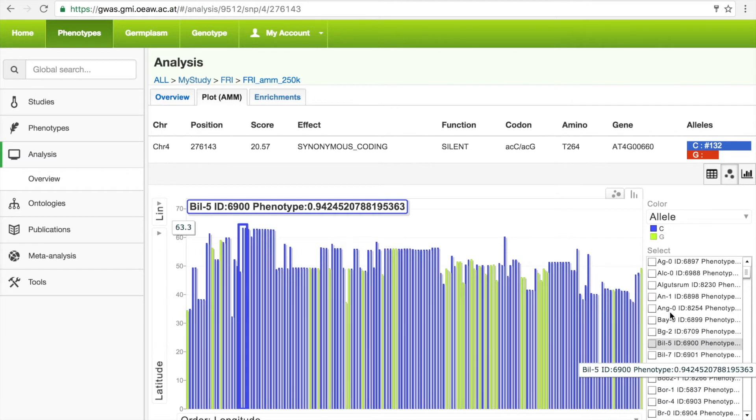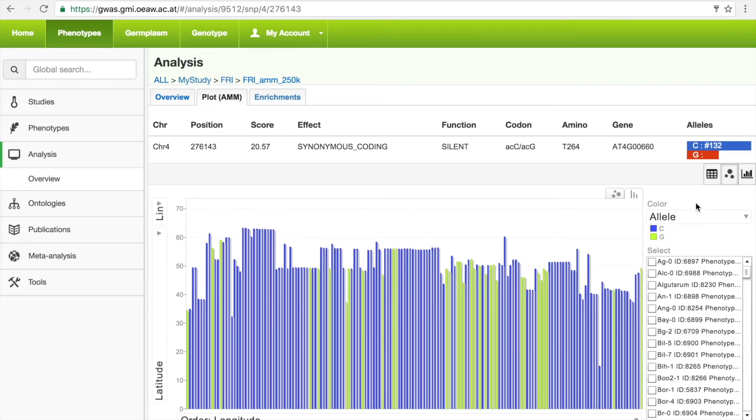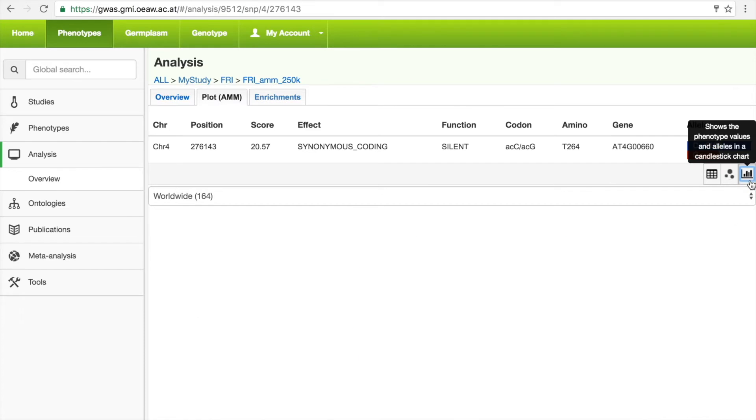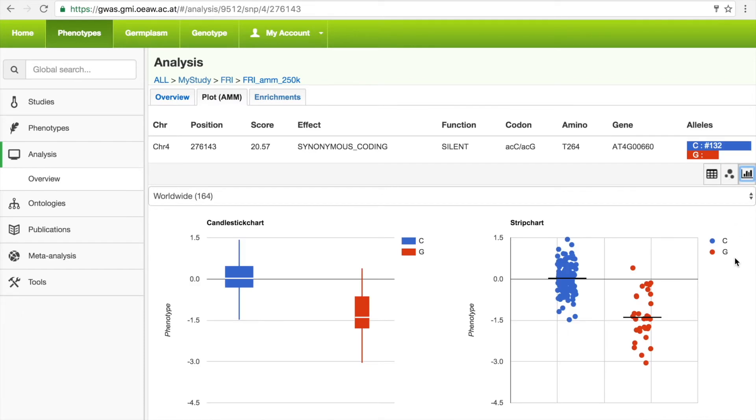This can provide a broad overview, but to determine whether the selected SNP has an effect on the phenotype, we can switch to the candlestick strip chart visualizations, which summarize the effect of the two alleles on the phenotype. We can see that the selected SNP does have a significant effect.